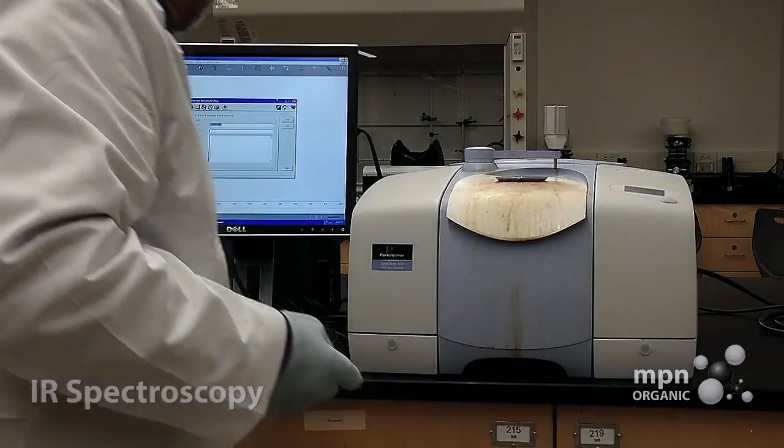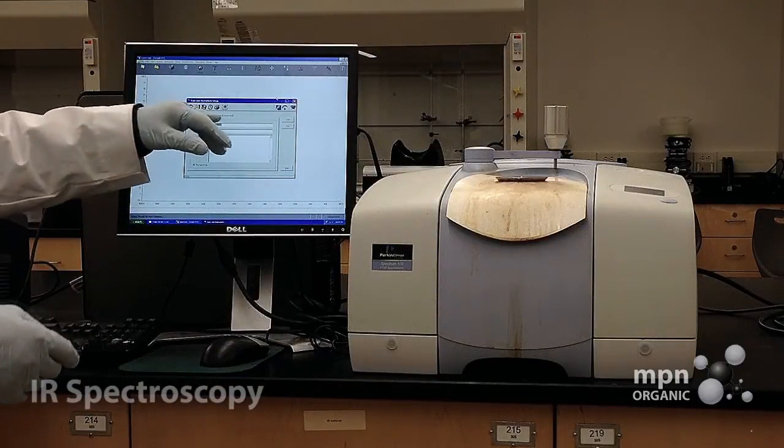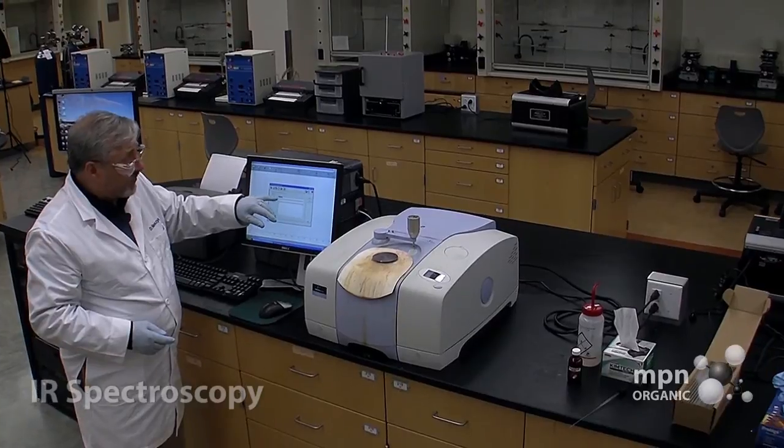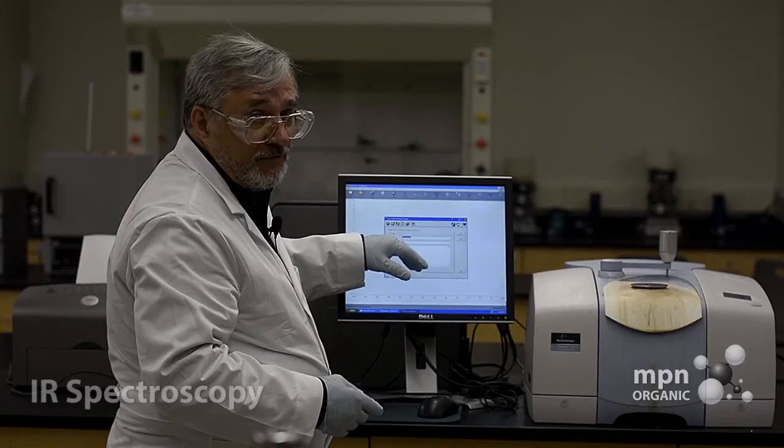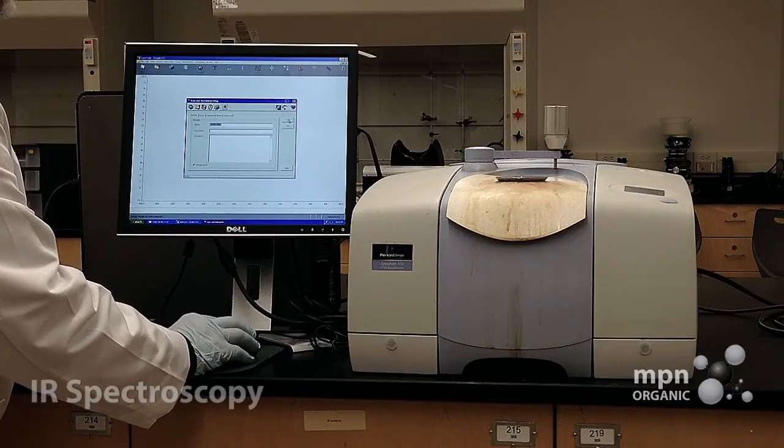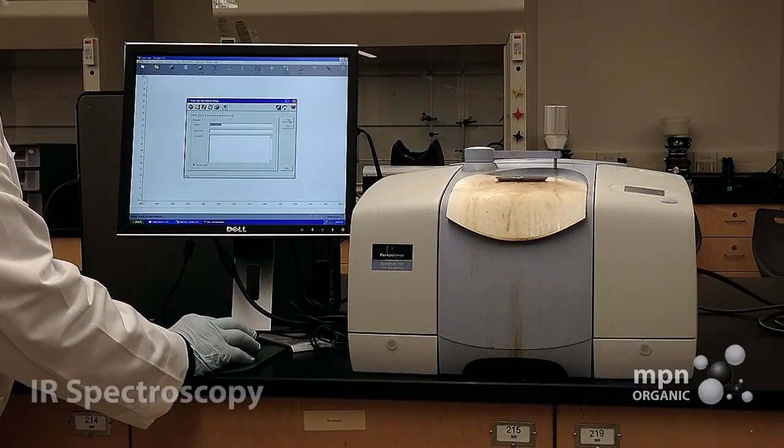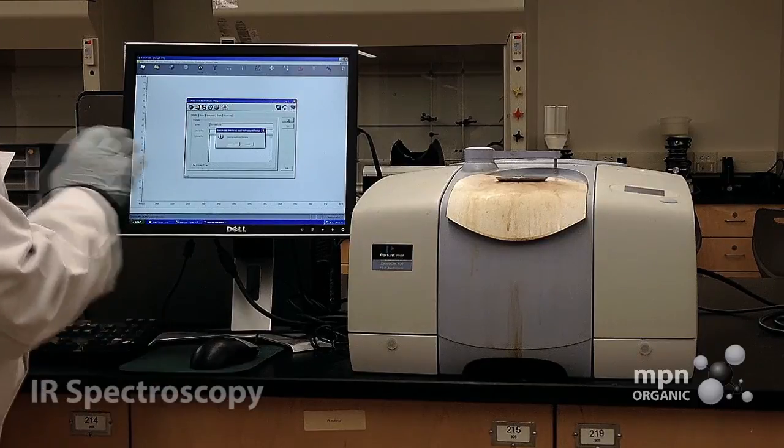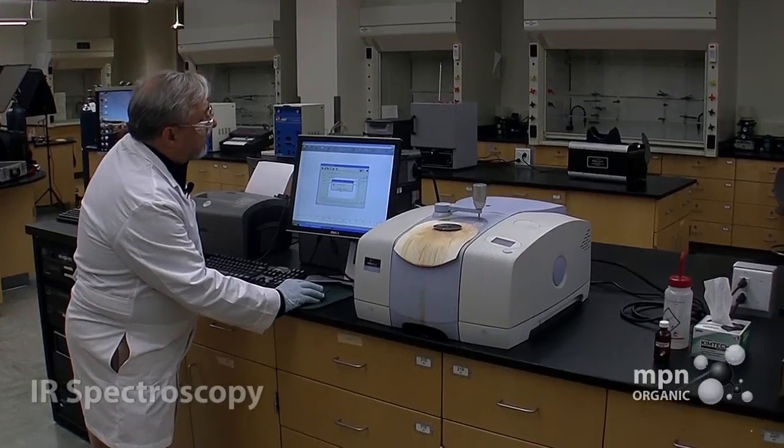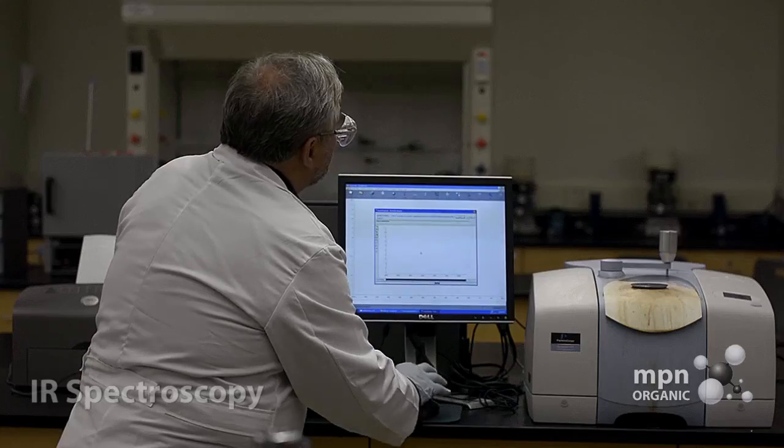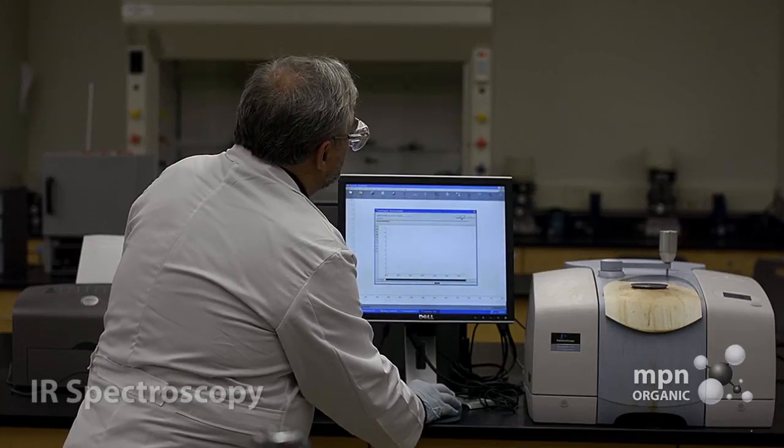So now we have the background. And I've typed in here already benzaldehyde, and that's going to identify the infrared spectrum that we get from this when we print it out. So once again, we're going to pulse this. But now, instead of taking background, we're going to do start. It says warning, duplicate file name. Yes, that's fine with me, and then scan.